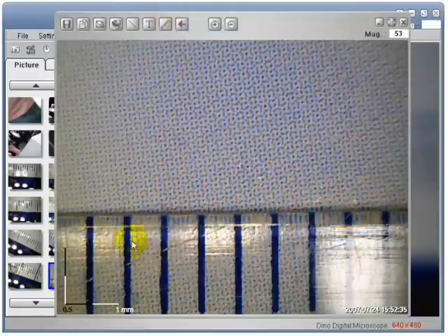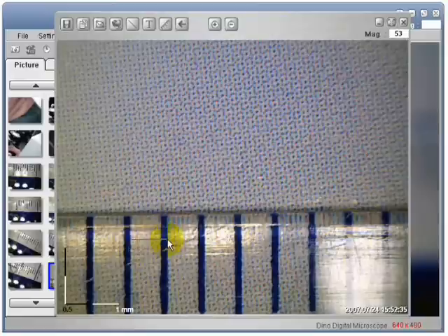I have selected a line. Left click one time to start. Left click one more time to finish.